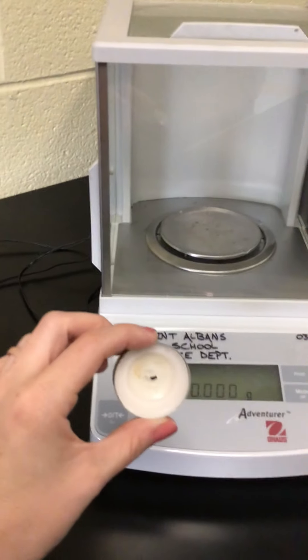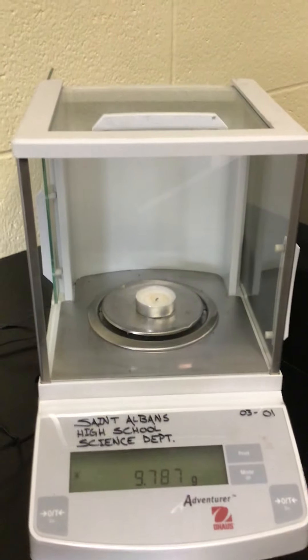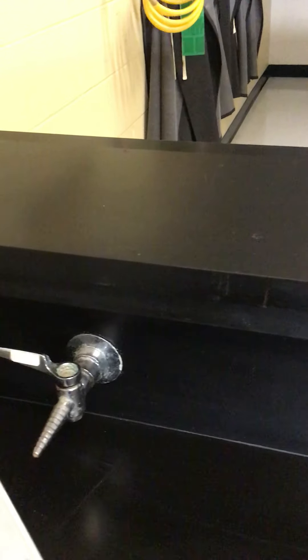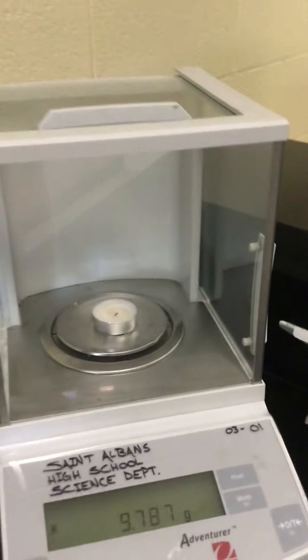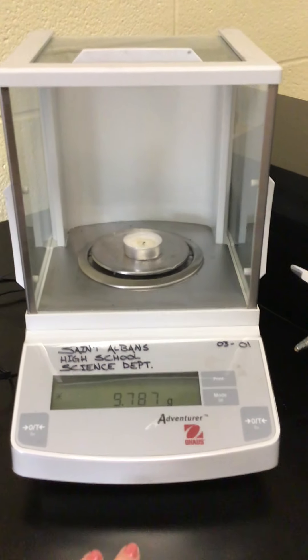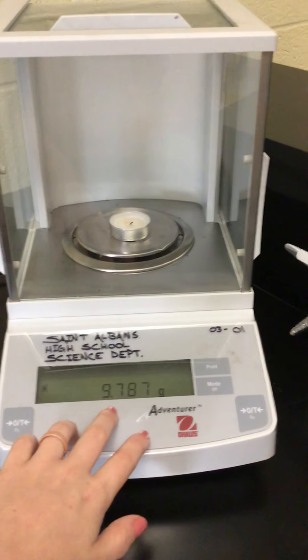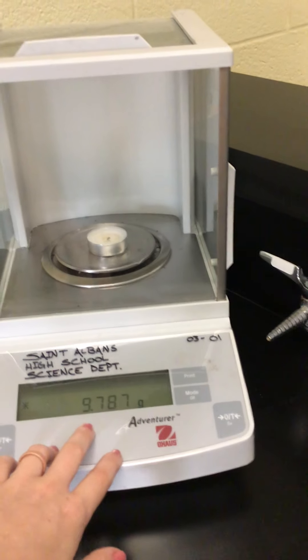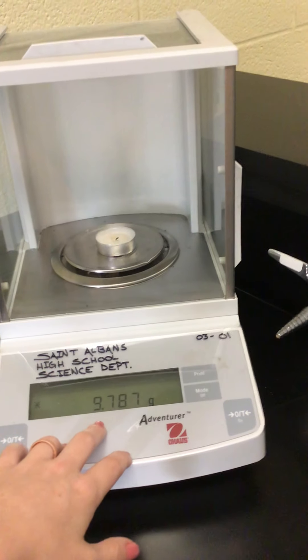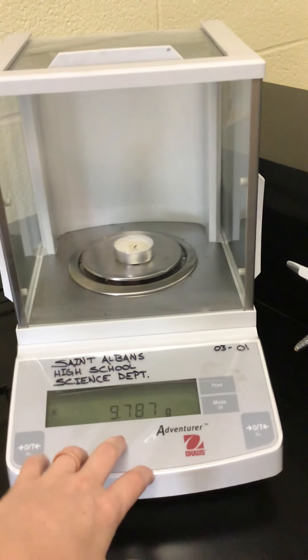Now I'm weighing our little candle for the candle lab so I'm gonna open the door, put it on our little circular weighing portion, and then I'm going to shut the door, wait for the scale to kind of get a constant reading. This one's really good, it doesn't fluctuate and that's why I like it so much. I could potentially give this measurement to the nearest thousandth of a gram.